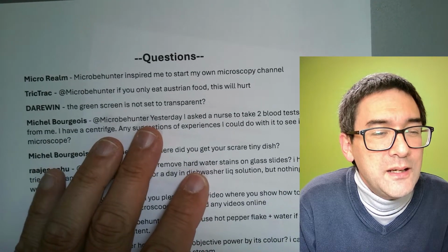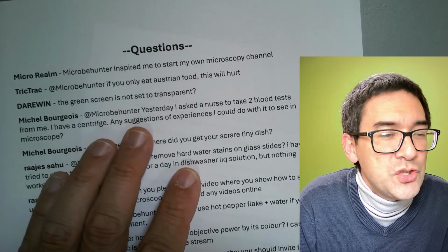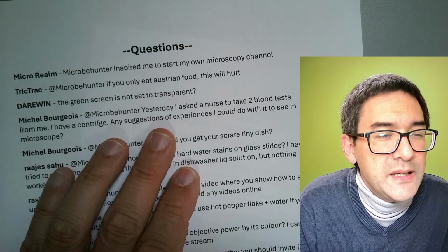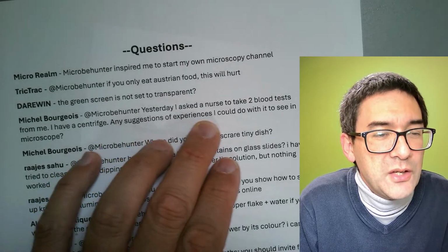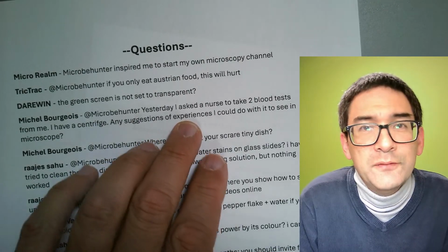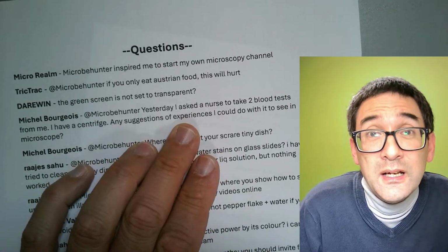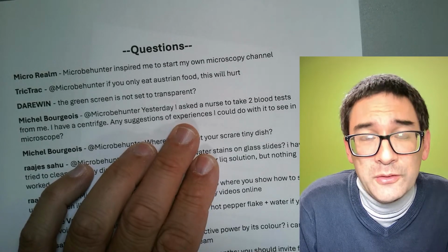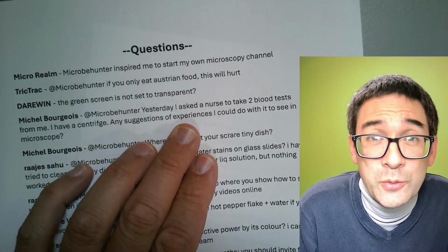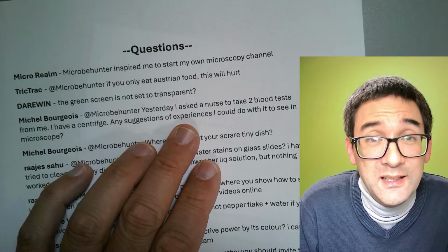Yesterday, I asked a nurse to take 2 blood tests from me. I have a centrifuge. Any suggestions of experiments I could do with it to see in the microscope? What you can definitely do, and I have made videos of this, is that blood is very interesting. You take a small amount of blood, put it on a microscope slide, cover glass on top, and you try to look for white blood cells.